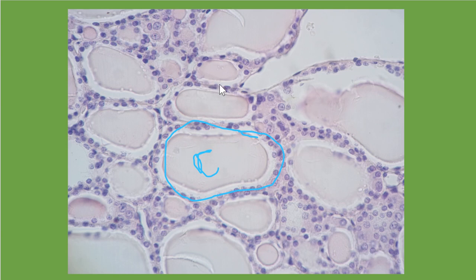These cells here would be our follicular cells. And over here would be our parafollicular cells. Here's some here too. Here's a big area of them over here.